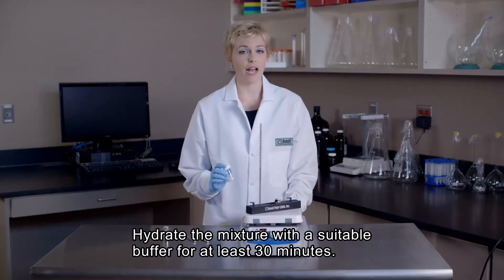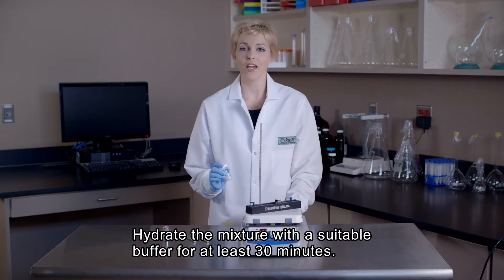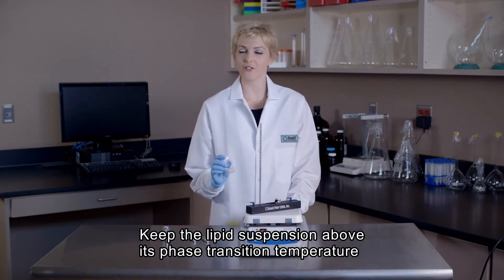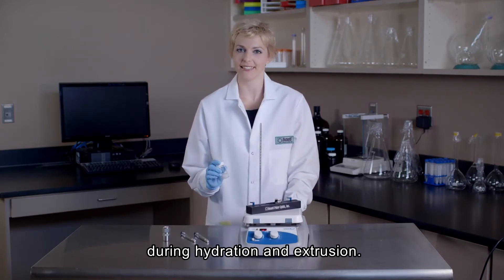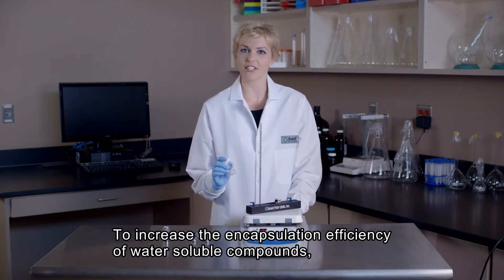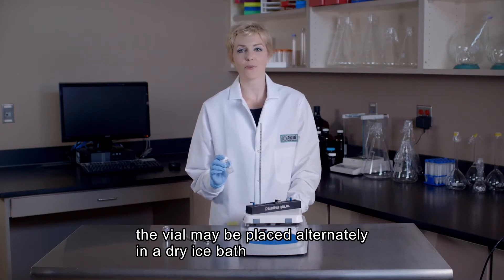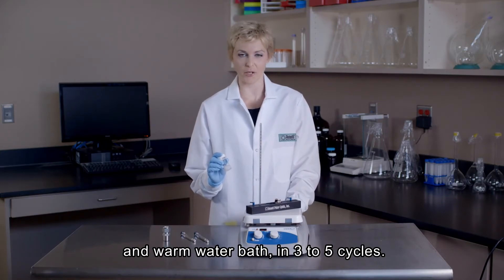Next, we will hydrate our dry lipid mixture using a suitable buffer for at least 30 minutes. Always remember, the lipid suspension should be kept above the phase transition temperature of the lipid during hydration and extrusion. As a quick tip, in order to increase the encapsulation efficiency of water-soluble compounds, the lipid suspension may be subjected to three to five freeze-thaw cycles by alternately placing the sample vial in a dry ice bath and warm water bath.